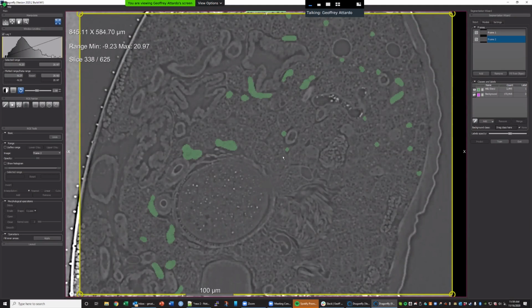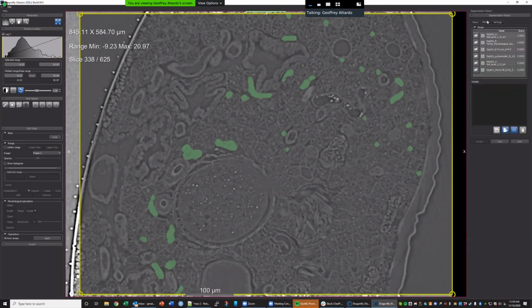Do you want a third frame? Let's start with 2. Okay. Yep. Now we could go to the models tab. The right models. Yeah, yep. Models. Oh, yeah. There are many.